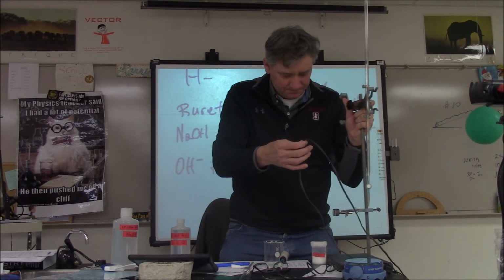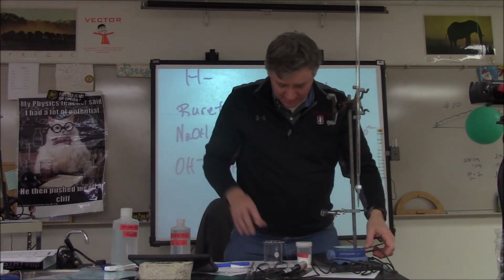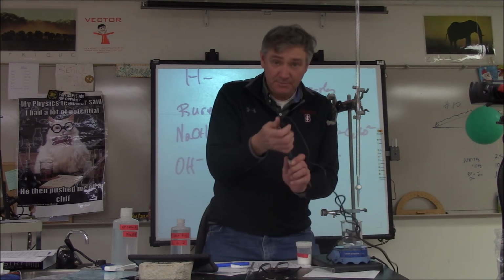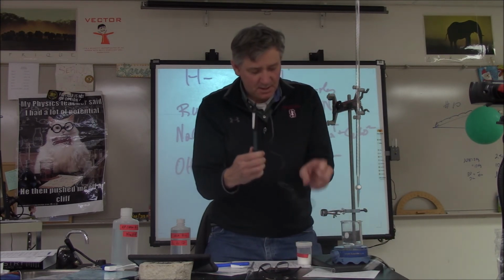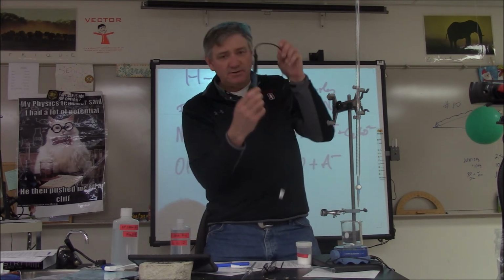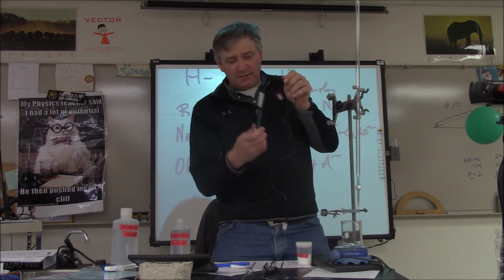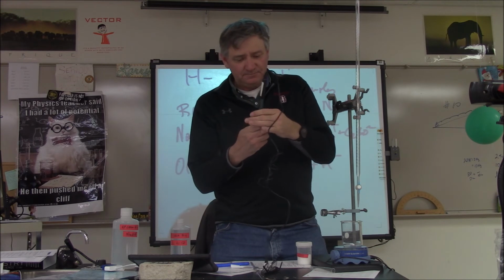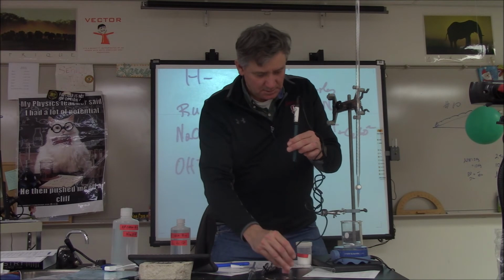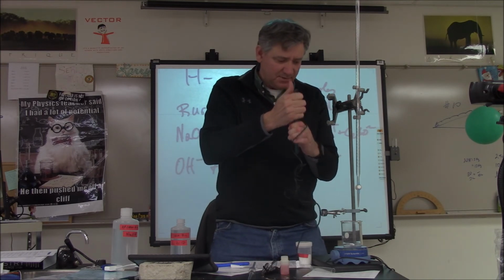Like so. So, you're here. You got the squib. Now, at this point, you're going to need your pH probe. I've got the LabQuest in there. There's your pH probe. Make sure, for all that is holy, that you don't let this turn upside down, okay? All you have to do is unscrew the lid, like so, and then you can pull the squeegee up like this.